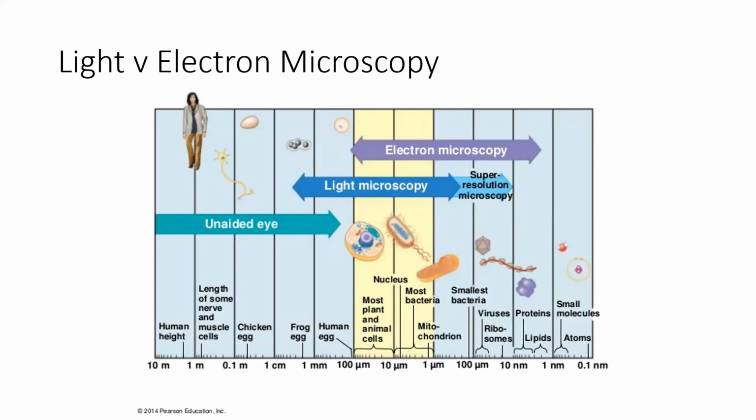Electron microscopy is great. I know that we are at the Center for Electron Microscopy and Analysis, so you all know what electron microscopy is, but I do want to just start with the very basics. Electron microscopy offers us the ability to image samples at very high resolution. And I would argue that it is better than light microscopy for this, although there are some techniques using light microscopy that can at least rival electron microscopy in terms of resolution. But there are limitations to that.